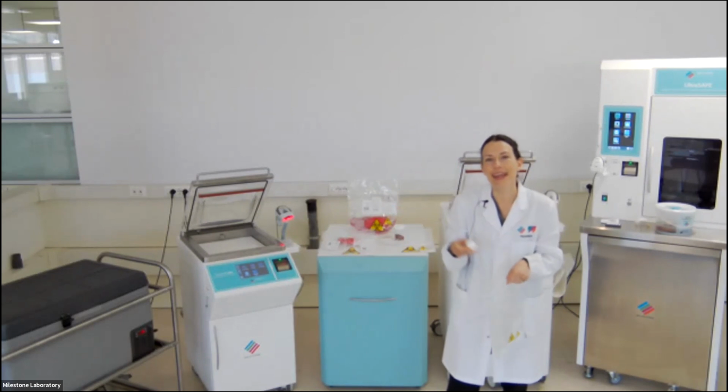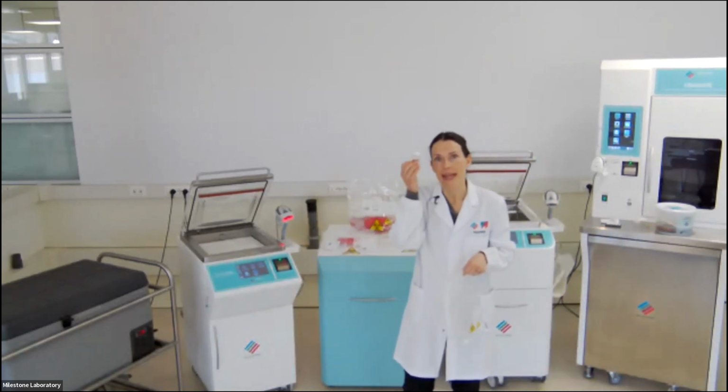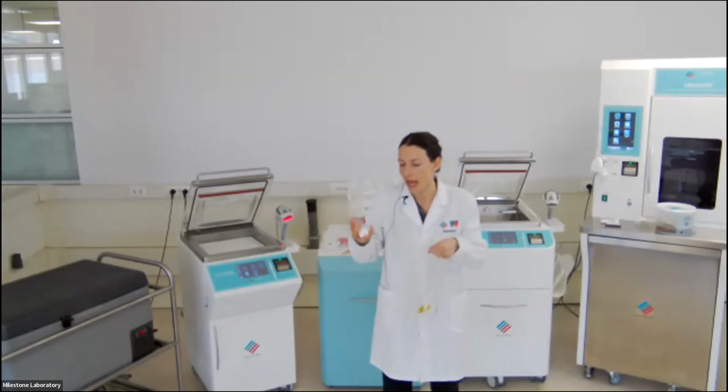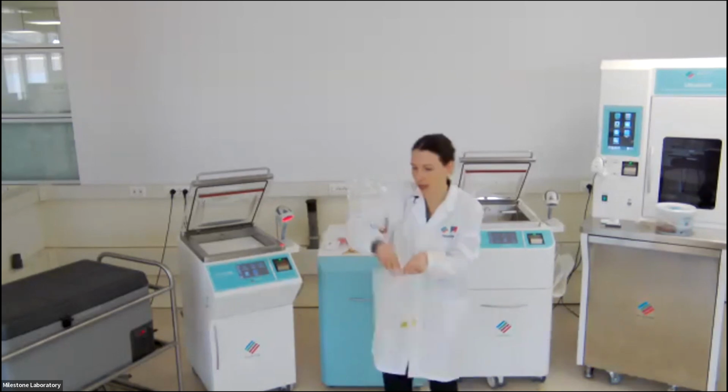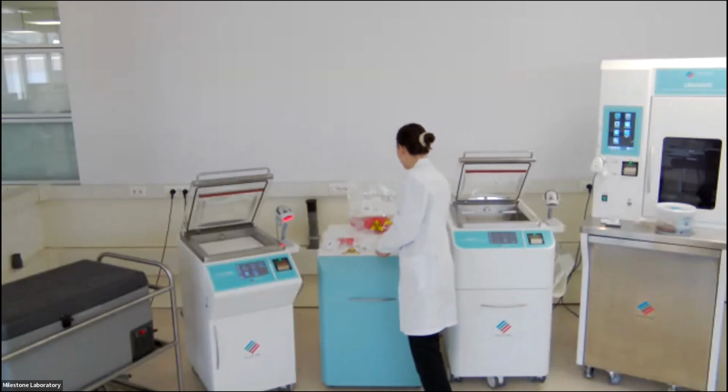There is not really a need to have this because the programs are correct. These containers are useful because you should not touch a delicate specimen too much. Imagine that you have a brain. If you have to insert the brain or extract it, it's better to have this to protect the specimen more from handling.